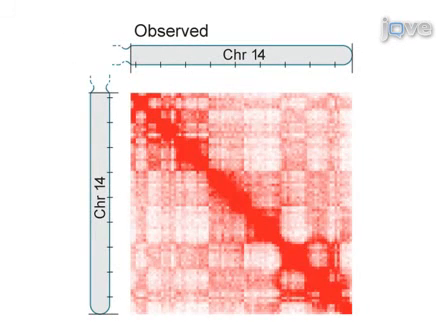The chromatin interactions can be visualized as a heat map, where the X and Y axes represent loci in genomic order, and each pixel represents the number of observed interactions between them. Typically, DNA fragments that are very close to each other in the linear genome will have the tendency to interact frequently with each other. This is seen in the intrachromosomal heat maps as a prominent diagonal.